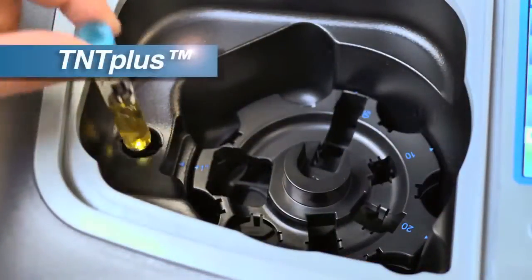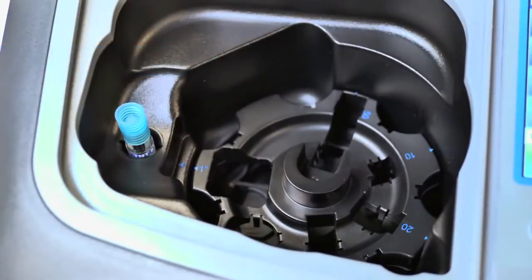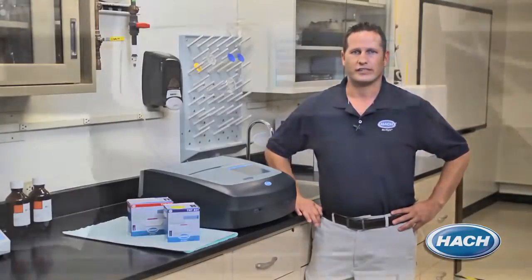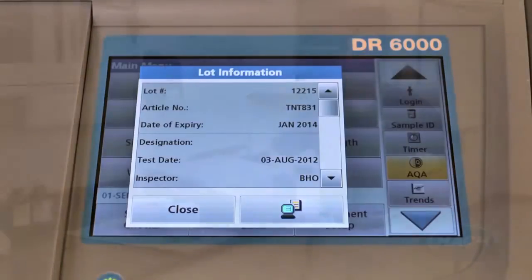There are additional benefits when using TNT Plus reagent vials with the DR6000. With the vials, the instrument will provide final results from an average of 10 readings during every test, which helps eliminate outliers due to scratched or dirty glassware. The instrument's RFID technology also identifies chemistry expiration dates, helping avoid possible errors due to expired reagents while providing on-screen certificates of analysis for your quality assurance programs.